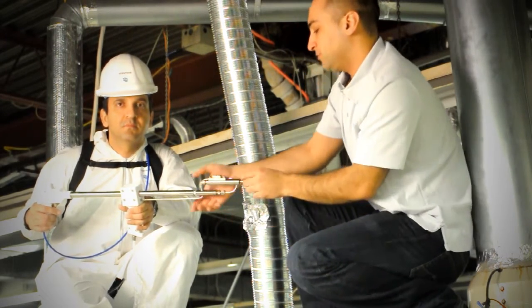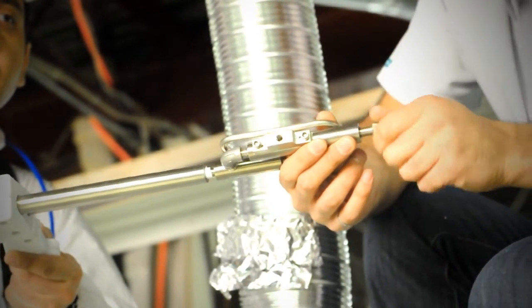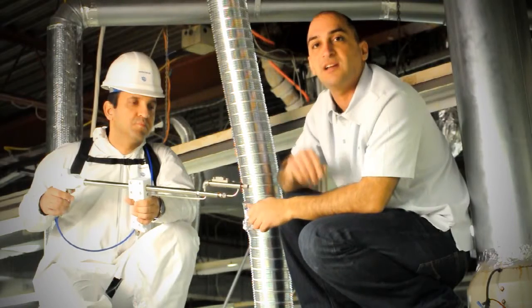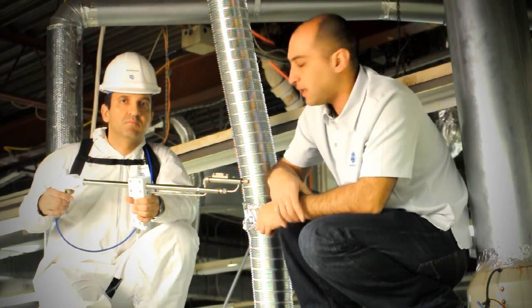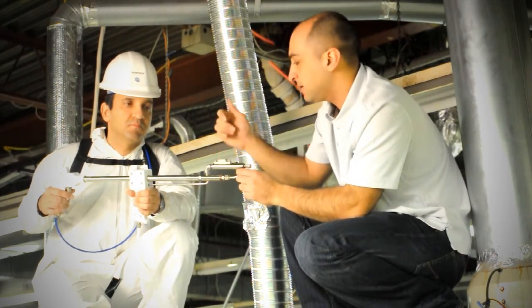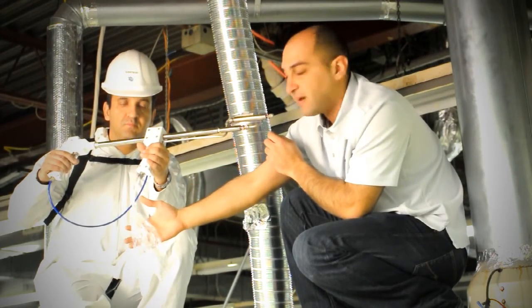Before we start, we're going to set the dilution we need. I have set it to 40 times clean air — or in this case nitrogen — to the sample. It's going to take this clean air, mix it in within here, and put it into the elephant bag we have here.